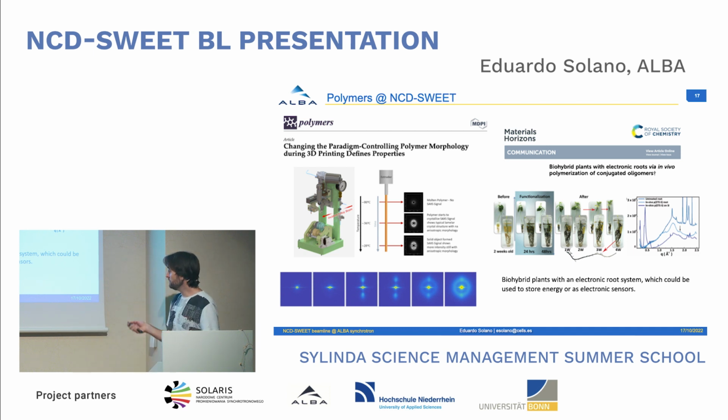So here is another example, which is very nice, a very basic fundamental application, but one with real industrial relevance, and it is really important for industry. Because here we had a polymer on a liquid, we put a plant on it, and then the polymer started to grow on the roots of the plant.